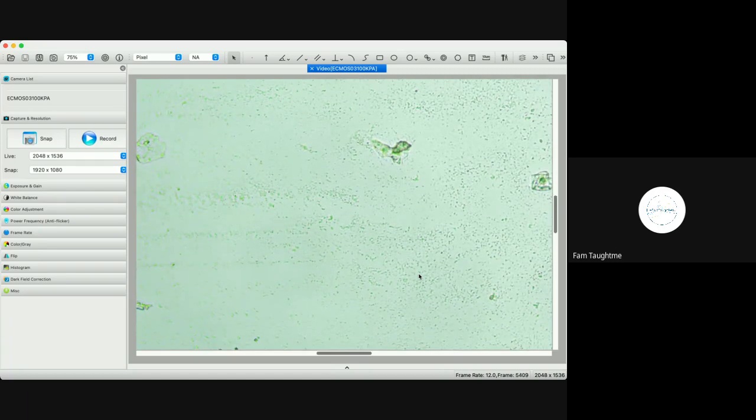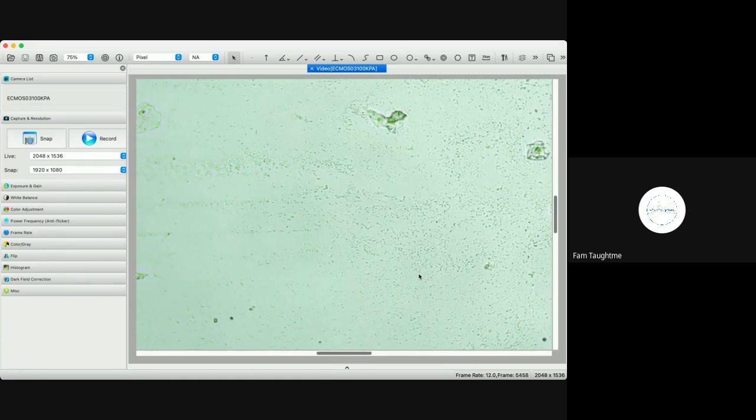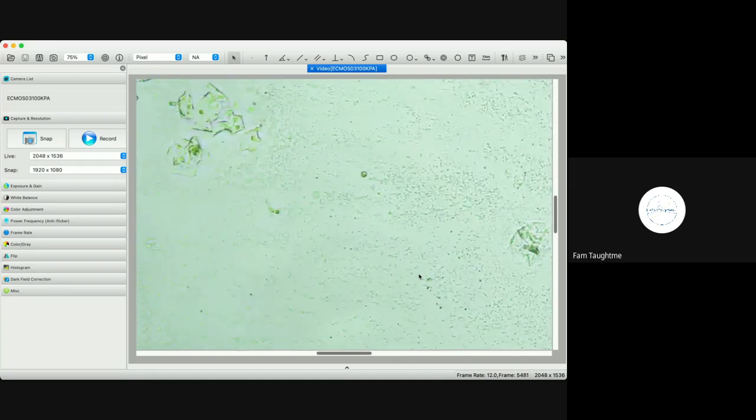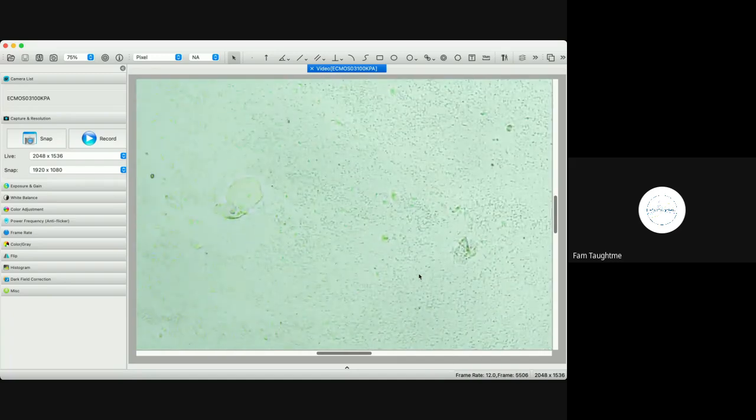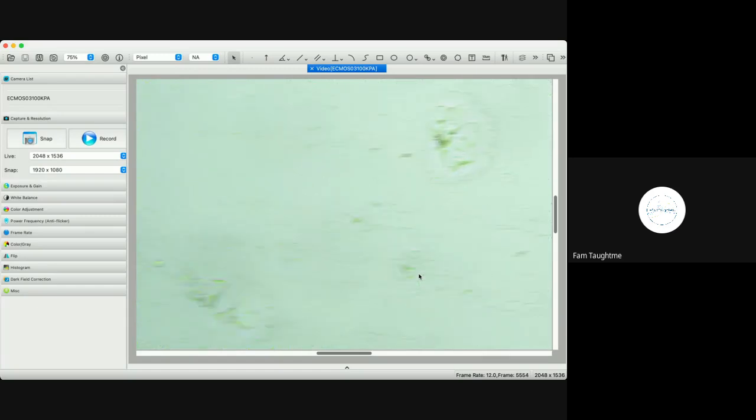You can kind of see some of the S mucus looks like it maybe wanted to form here. It's kind of going across, but then it loses its shape and it's just amorphous. You can see it a little bit more here.